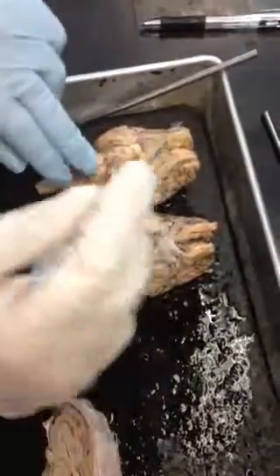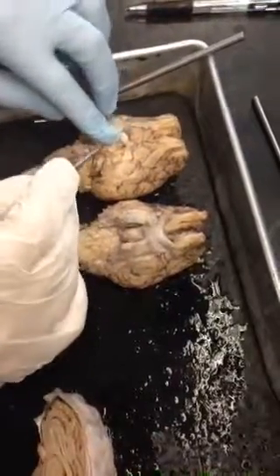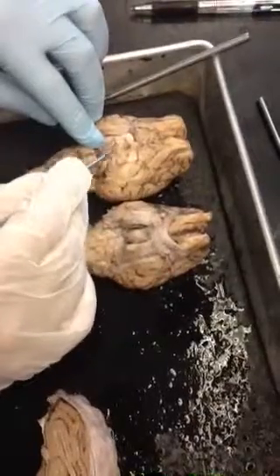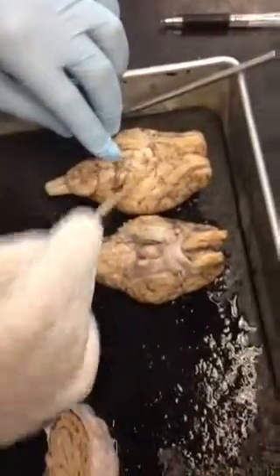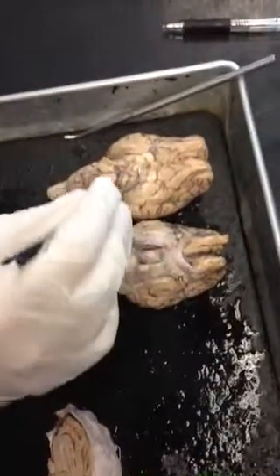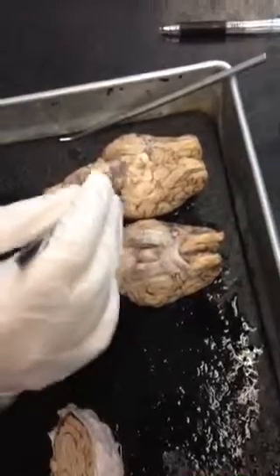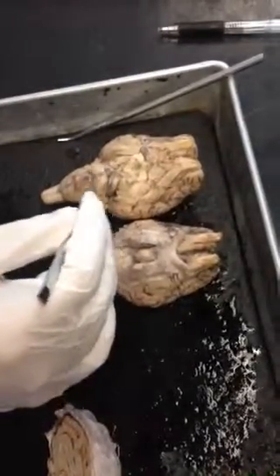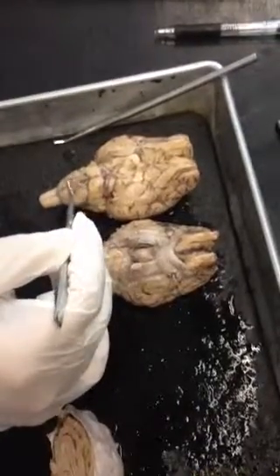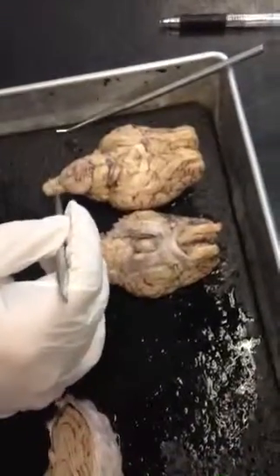The mammillary body. If you find this hole right here, this area right behind it is the mammillary body. There's one on both sides. And then the cerebral peduncles are right behind the mammillary bodies. There's two of them, one on each side. Then the pons is the bump right here, like a speed bump. Then the medulla oblongata, and then the spinal cord.